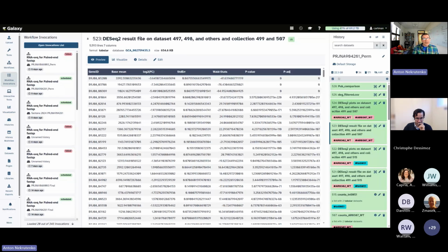And so at the end of the day, it performed essentially the correlation analysis between the two. Let me find the right slide here. And these correlations were quite good. In fact, what my workflow was doing was very much, let me magnify this a little bit.